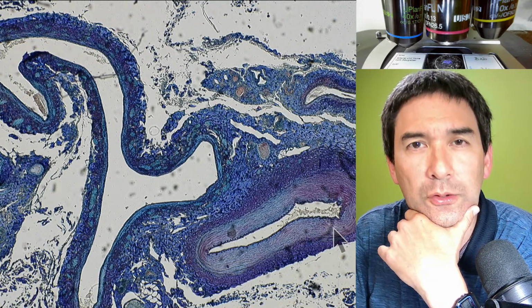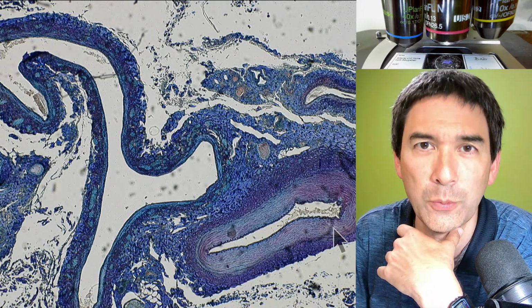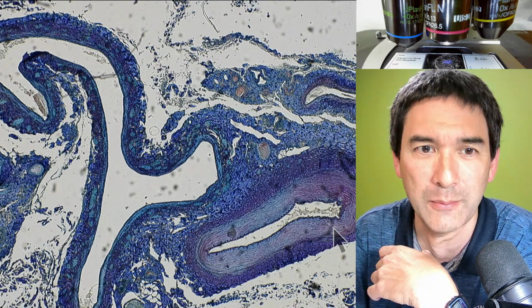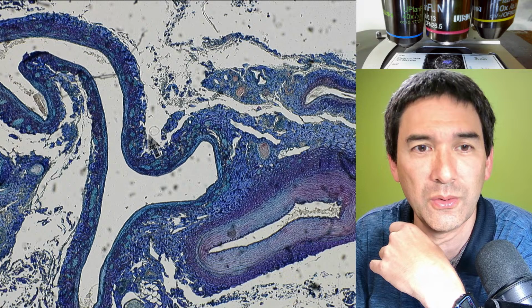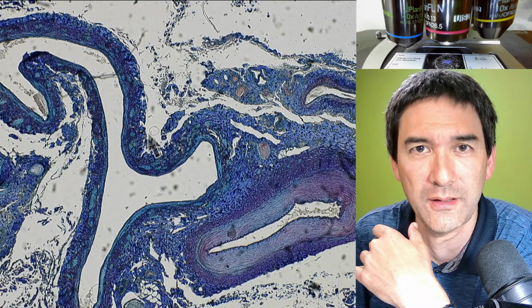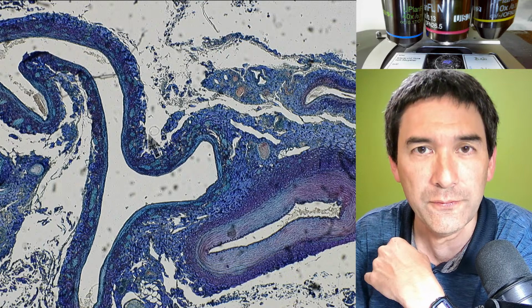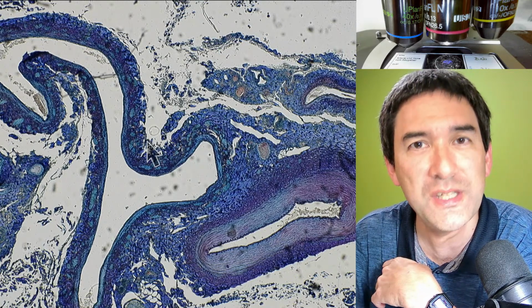And this field of view is different from microscope to microscope and from camera to camera, and it depends also on the size of your camera sensor. So the thing is the following: if I tell you right now that I'm using a 4 times objective, this does not necessarily mean that you're going to see it the same way.